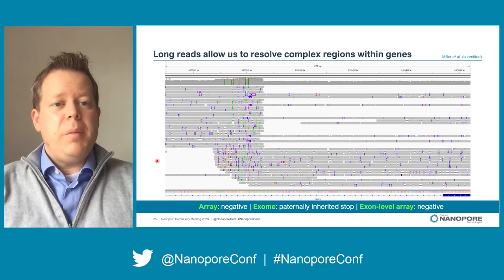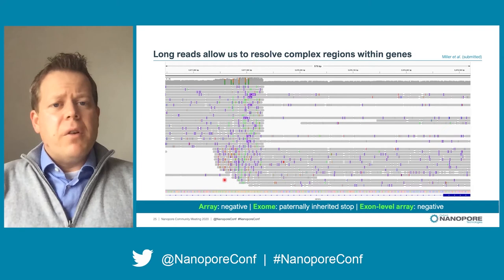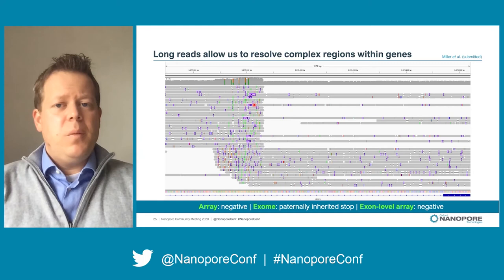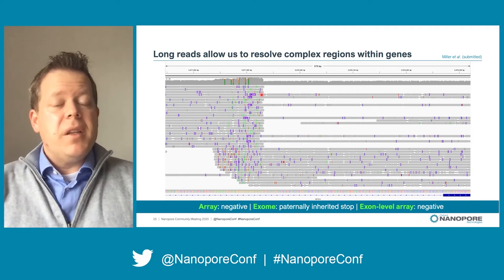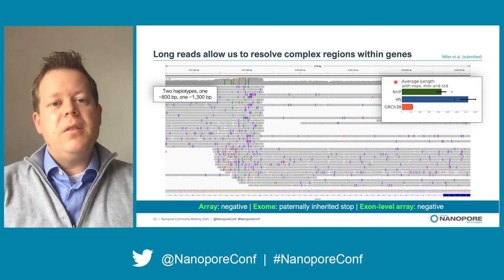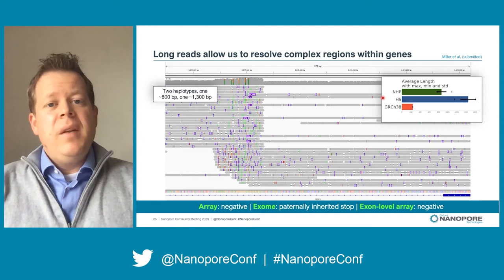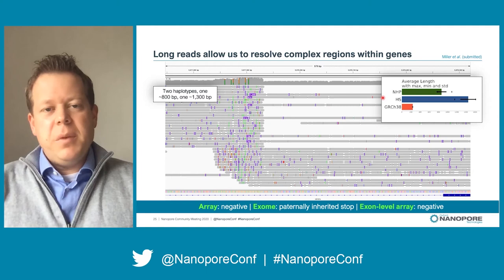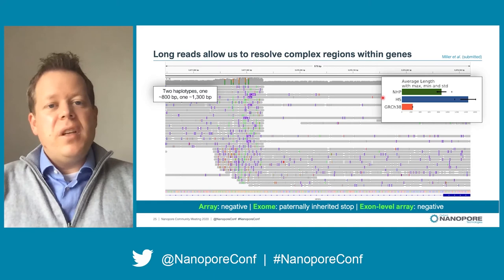With our structural variant calling we found a structural variant in the gene that's a nice example of the extra information long reads can provide. This is an IGV view of a repeat known to be polymorphic in humans — about 200 base pairs in the reference genome. Each gray bar is a read, with an exon on the right and an intron making up most of the view. Some reads span the repeat expansion, and those show two haplotypes present — one about 800 base pairs and one about 1300 base pairs. This lets us determine that both expansions fall within the range seen in non-human primates or human samples, making it unlikely — though not impossible — that something in this repeat represents the second hit. With short reads alone we wouldn't be able to definitively exclude this region, but with long reads we can do that with high confidence.